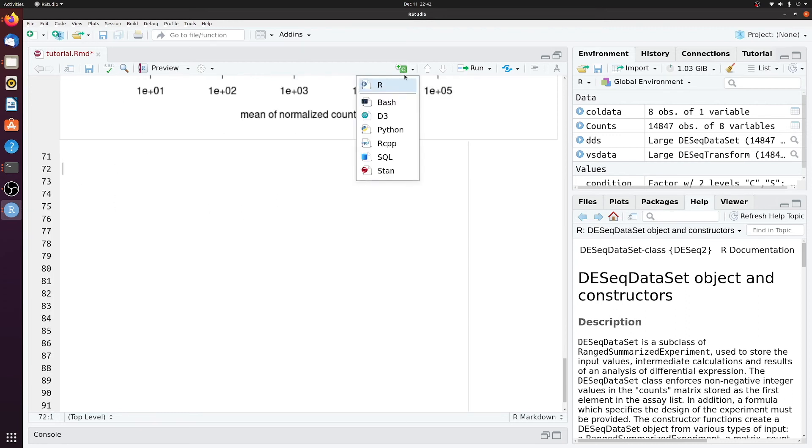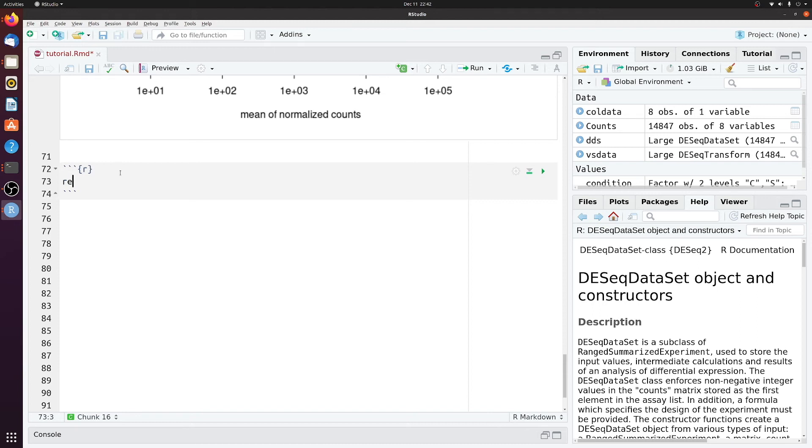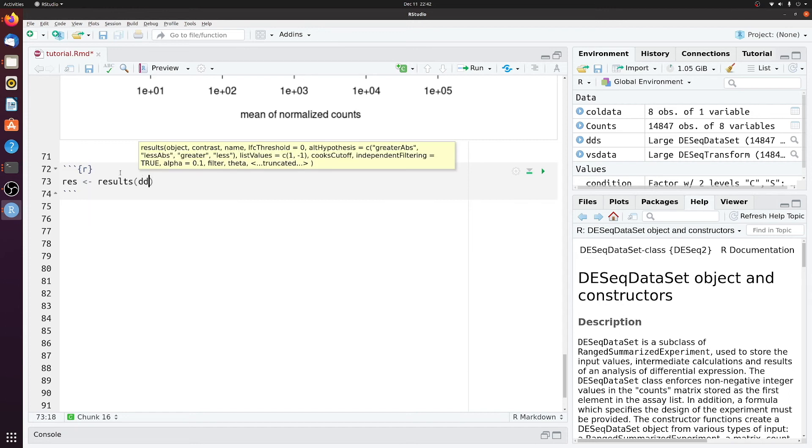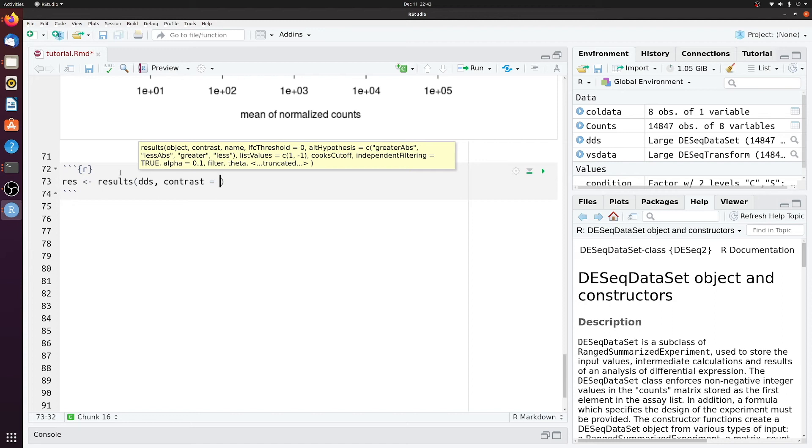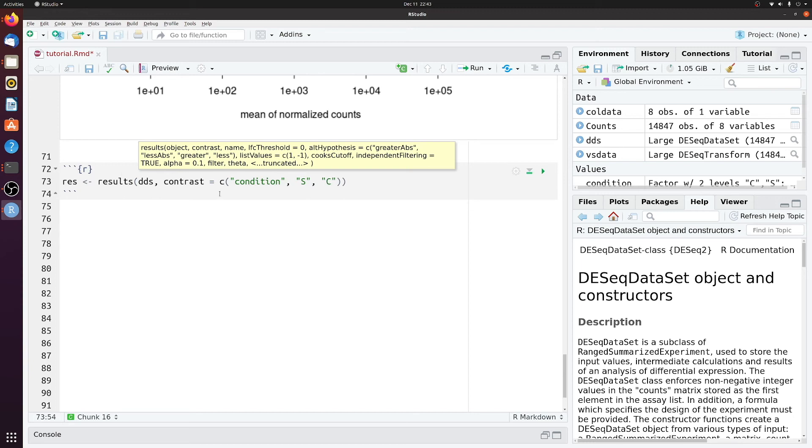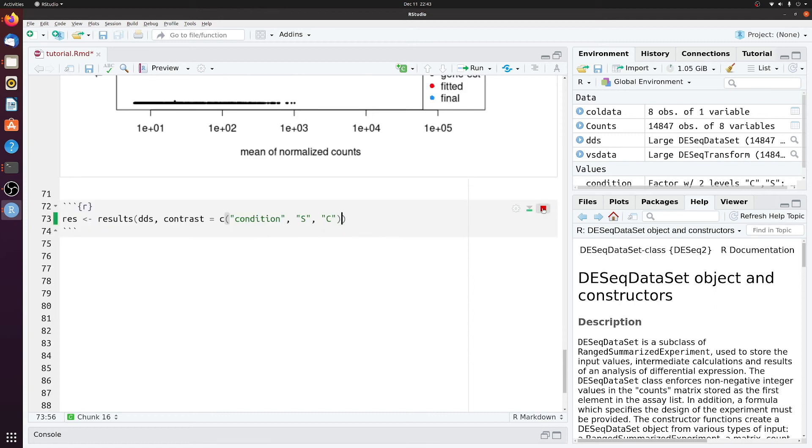Next, we'll actually create a table of the differentially expressed genes. So we'll call it res for results, and then call the results function of DESeq using the dds object, and then using the contrast, which is just telling it what samples to compare. So this is especially useful if you have more than two samples. I think the default works without adding this argument, but it's nice to actually put explicitly what samples you're comparing. Let's put the vector condition. And then condition c. Actually, let's compare the sample against c. So s versus c. If you did the default, it would have compared c versus s, because it would have found c first. So let's run that. Might take a second.